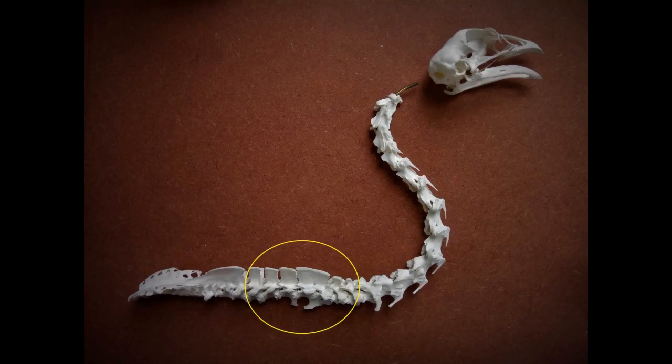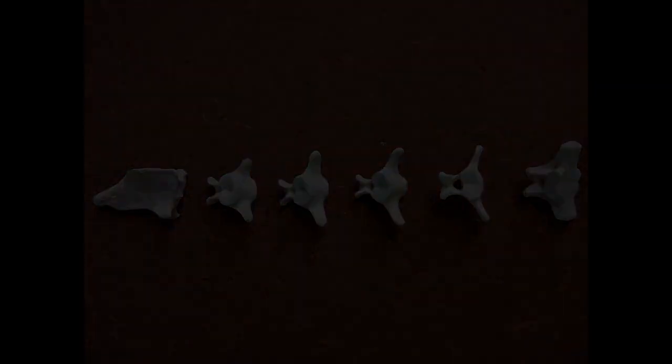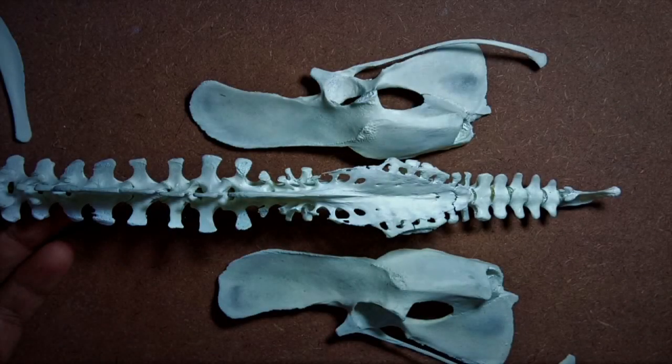Once you're done gluing the cervical vertebrae, proceed with gluing the thoracic. Once you're done, spare a length of the metal rod equivalent to about half the length of the synsacrum and cut off the rest of the rod. Then glue the synsacrum in position. The caudal vertebrae do not need a wire to fix them — hot glue alone would suffice. We now move on to the pelvic girdle. This is technically not a part of the vertebral column, but it articulates with the synsacrum and thereby appears closely associated with the vertebral column.